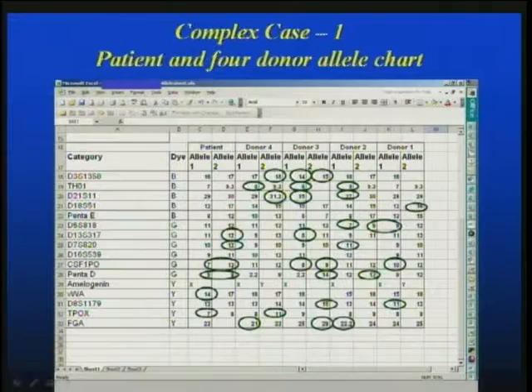And so there's all these loci that would show up. Unfortunately, if you look at all of these circles, you can see that none of them extend across all five individuals. If you wanted that, there's only a single locus that one could have used. Now this is a problem for us because we prefer not to use a single locus, and I'll have another case for you shortly depicting why we prefer using more than one locus when it comes time to doing this engraftment analysis.